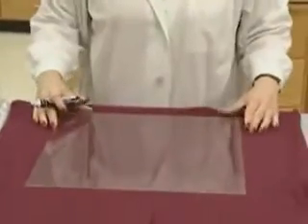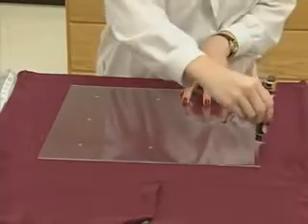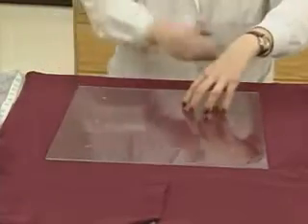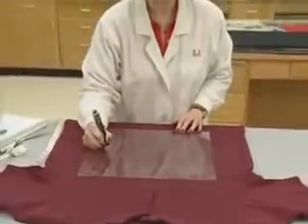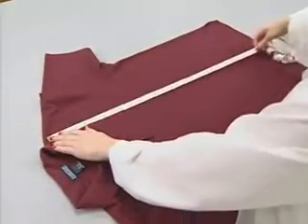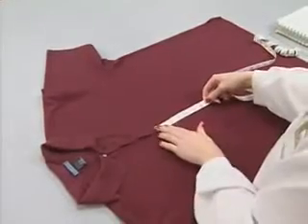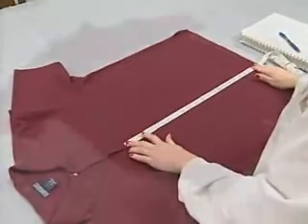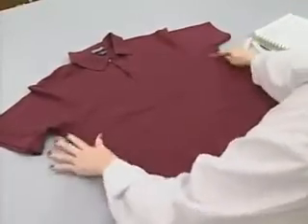If the area of the garment allows for it, 18-inch benchmarks may be placed on the front or the back of the shirt, starting above the hem and just below the neck, and at least 1 inch from all edges and seams. If the size of the shirt prohibits an 18-inch mark, then a 10-inch mark can be used. After laundering and conditioning, the shirts are again laid on a table and the same benchmarks are measured again. In order to determine the shrinkage, the length of the washed condition is subtracted from the original length. This difference is divided by the original length, and the result is multiplied by 100 to give the percentage.